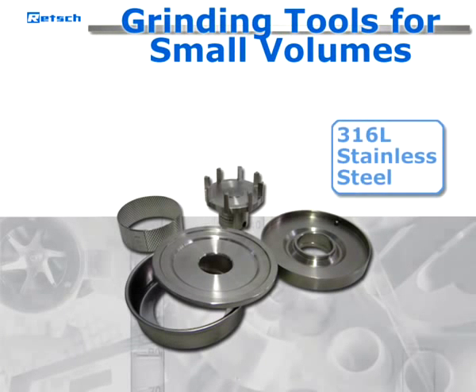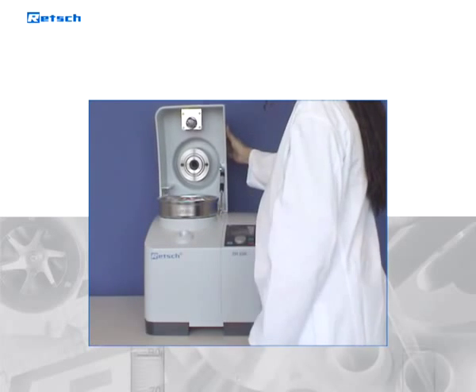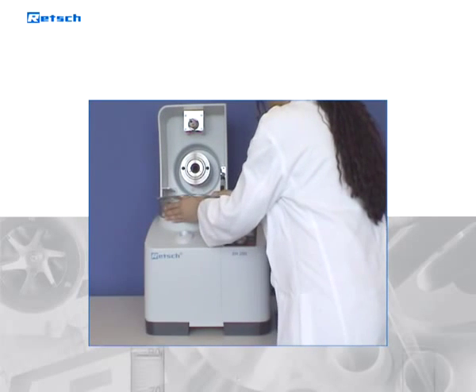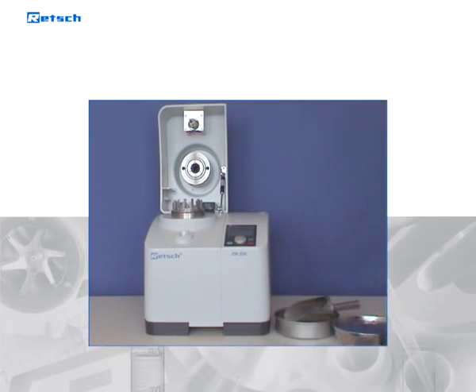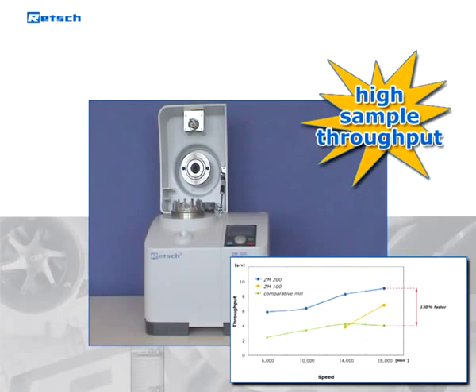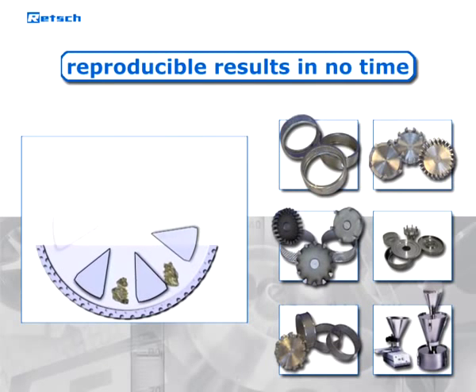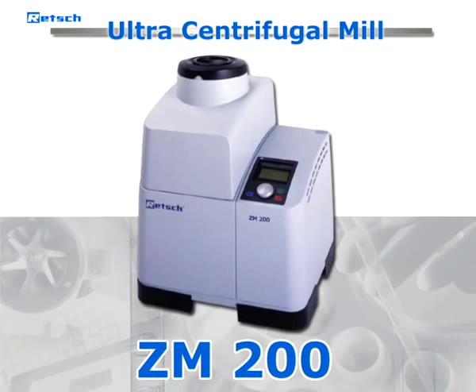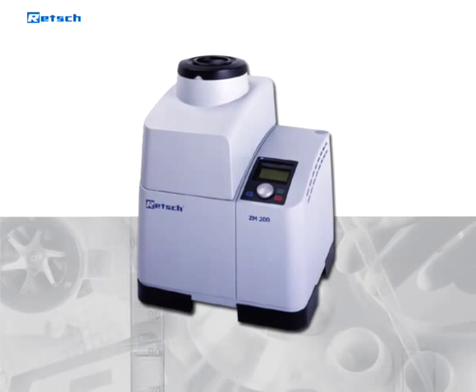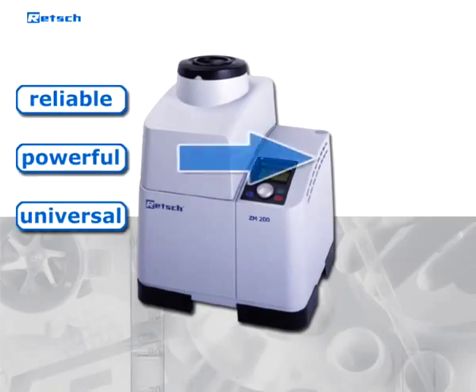Grinding tools for small volumes of high alloyed steel for the pharmaceutical sector. The exceptional reliability and safety combined with ease of operation make the ZM200 extremely convenient to the user. This heavy-duty mill is not only surprisingly quiet, but its power drive allows for a high sample throughput. Due to the effective pulverization and the wide variety of accessories, reproducible results are obtained in no time. All these advantages make the Retsch ultra-centrifugal mill ZM200 the optimal device for reliable, powerful, and universal high-speed grinding for excellent results in no time.